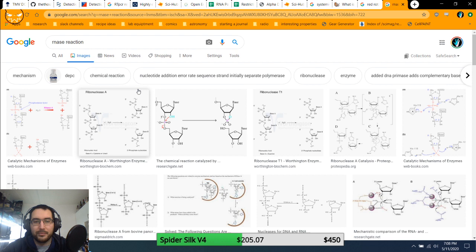Oh, yeah, it's true. It would make it into monophosphates, wouldn't it? And you really need the triphosphates. Huh. Okay, that is actually a problem.